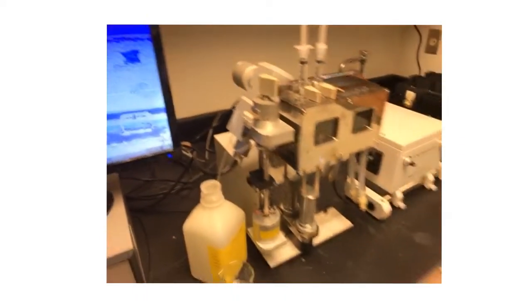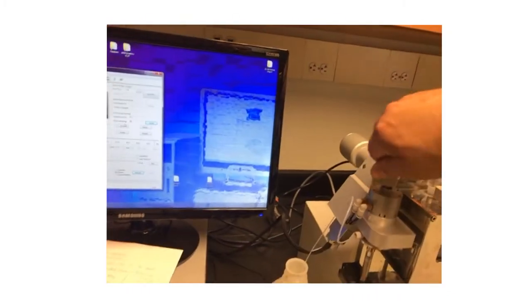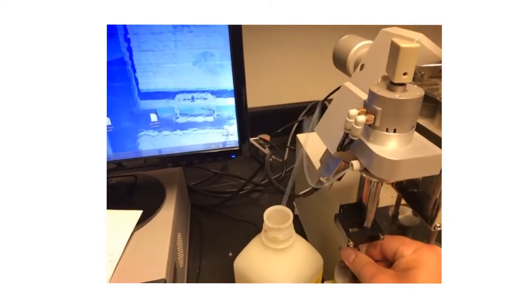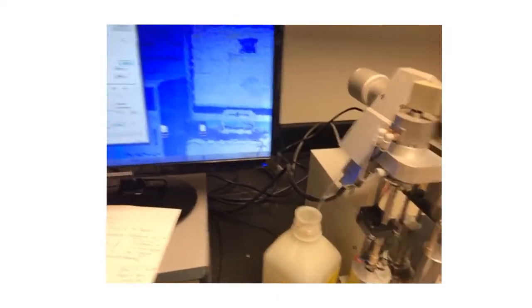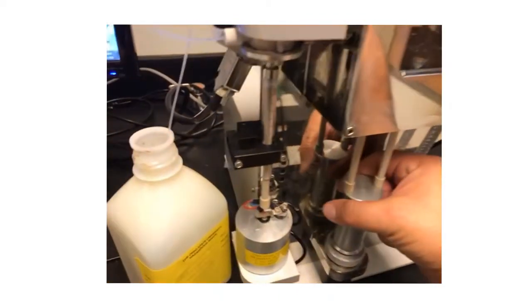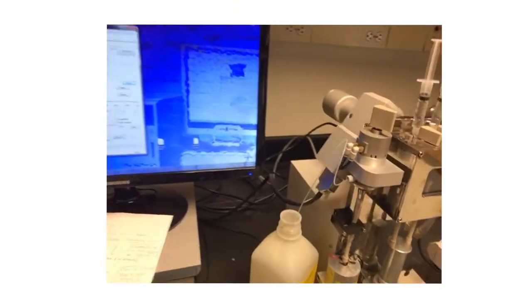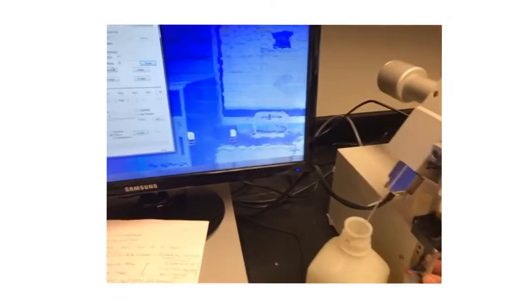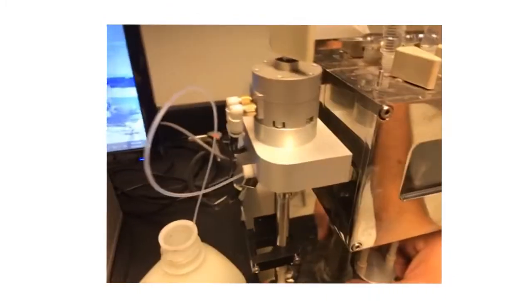Now, the way to do this process manually is if I flip the syringe valve here, then I can drain my waste reservoir, if you will, flip it back, and then I can just lift up on the plunger accordingly. And I get about five shots in one. Then I can do another five, flip back, and then lift up.